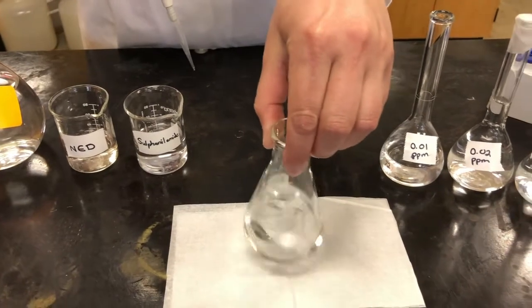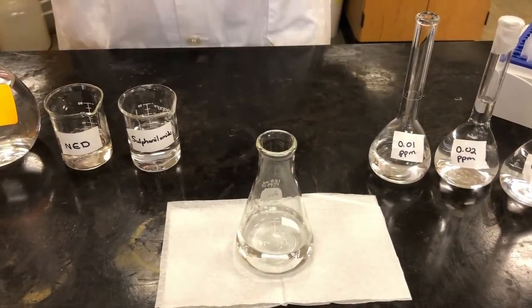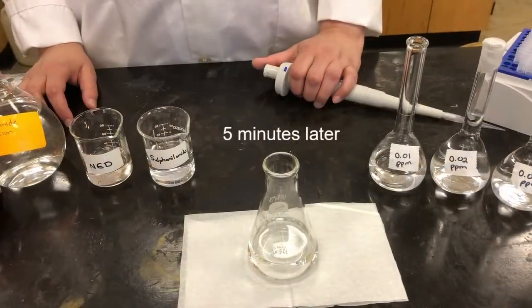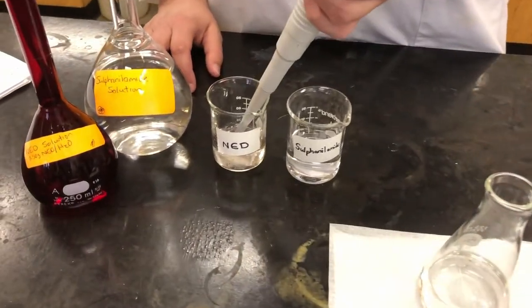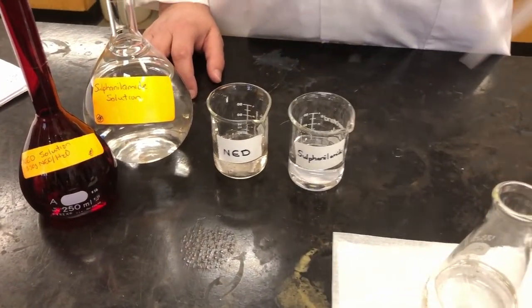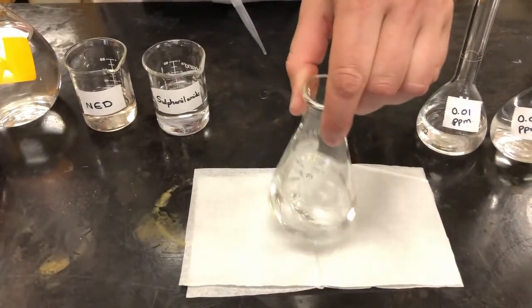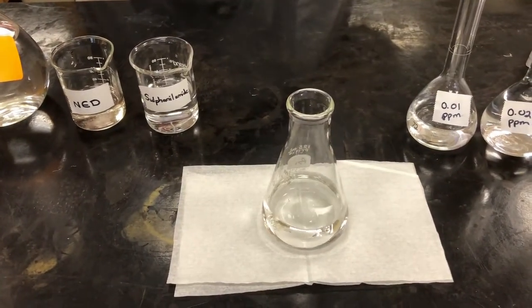Just give it a mix. And we're going to let that sit for about 5 minutes before we add the NED reagent. So that time is up. Now we're ready to add the NED reagent. Again, it's 1 milliliter of the NED reagent to that same flask. Mix that in. And we have to leave this one now for 10 minutes for the color to develop.